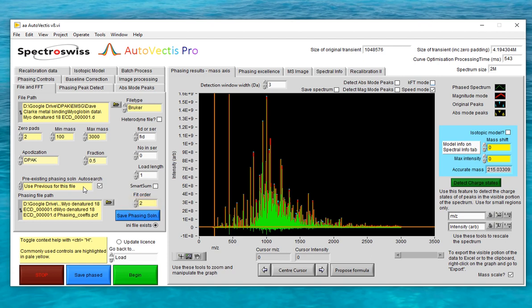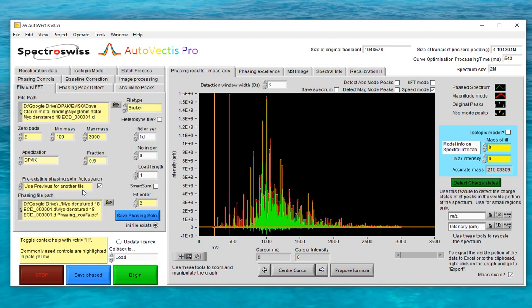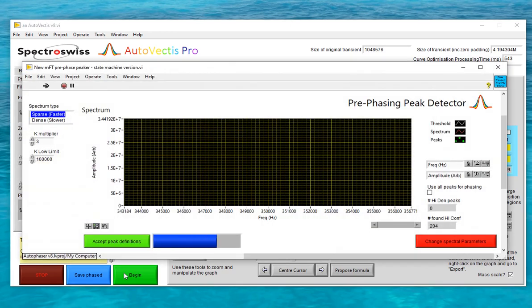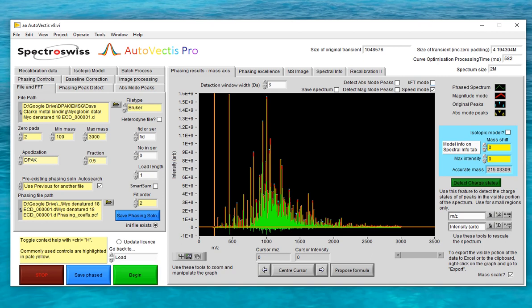If you wanted to use a PCF for a different file, you simply browse for it using the Browse button. Now I'll change modes to Use Previous for another file and process this same spectrum down that route. As the processing goes through, you'll notice that the genetic algorithm window will pop up whilst the spectrum is being processed — this is the system re-optimising the phase correction function to this specific spectrum. And as before, we can tell that Autovectus has reached the end of the processing workflow because the begin button is flashing again.